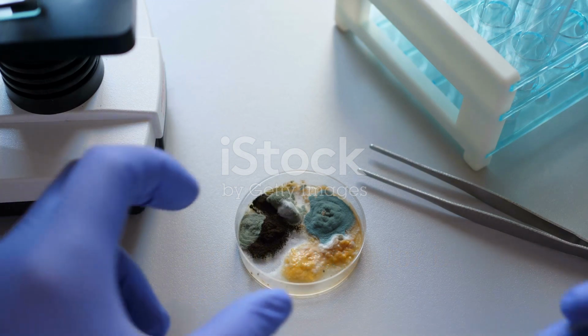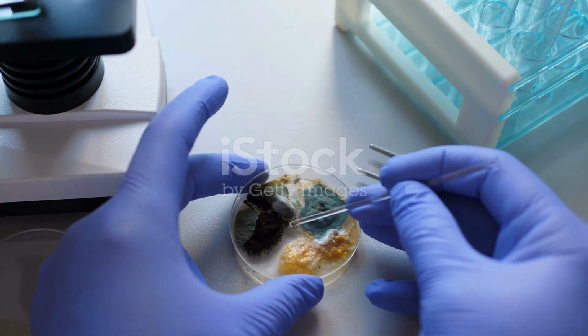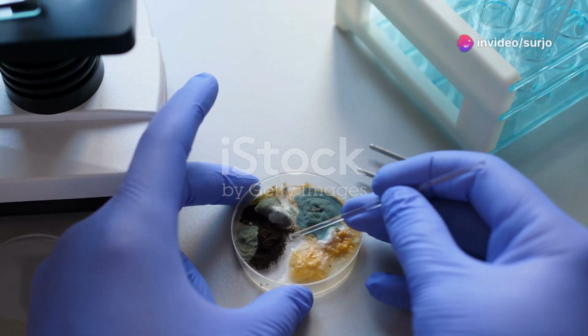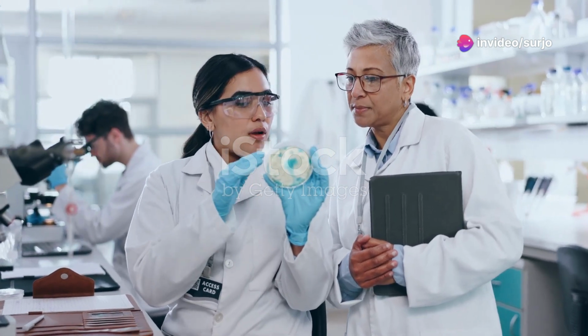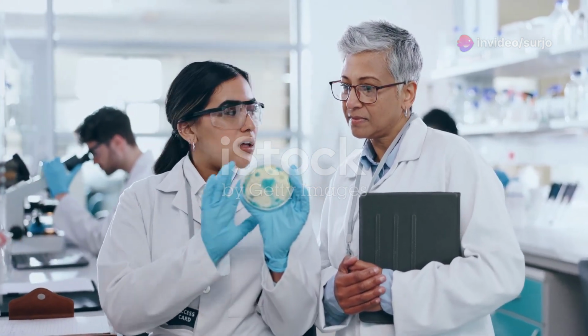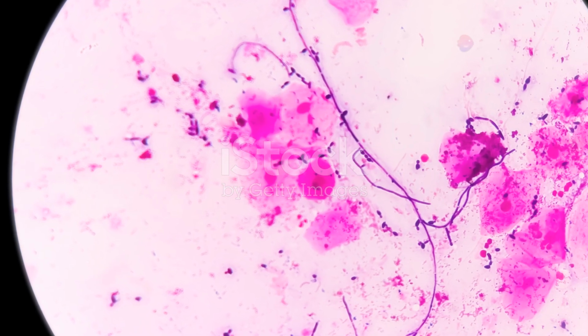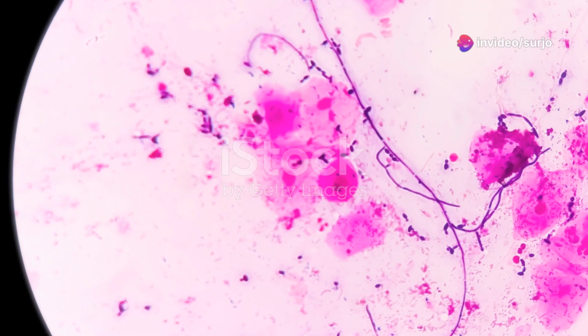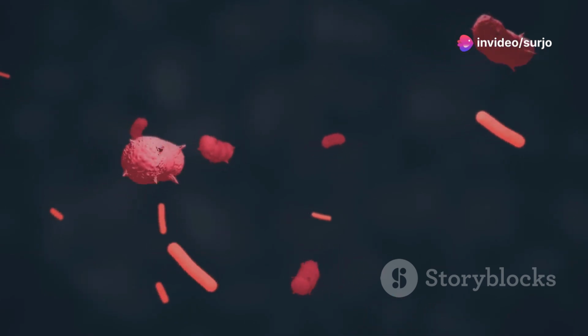In the vast and diverse world of microbiology, identifying and classifying bacteria is paramount for understanding their roles in various ecosystems and developing effective strategies for managing their interactions with humans. While microscopy reveals their shapes and arrangements, a technique called Gram staining provides crucial insights into their cell wall structure, a fundamental characteristic that dictates their response to antibiotics and other treatments.